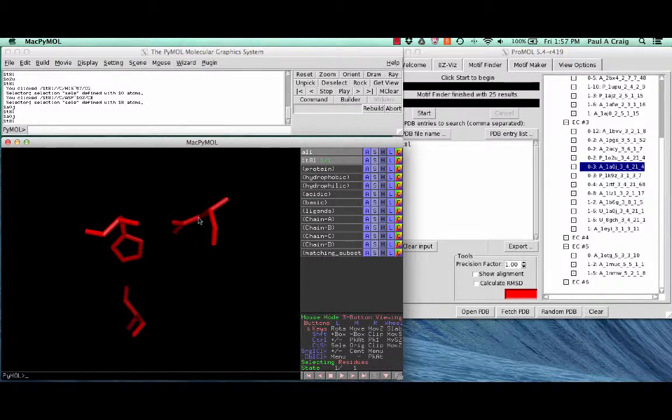When I click on them, the first one, if you look in the PyMOL GUI, you'll see it listed there. It says you clicked /1T8L/C/ASP102/CB. Let me explain that. It's a structure 1T8L. We already know that. Chain C, the residue is aspartate, ASP. The residue position is 102. And the actual atom I clicked on was the beta carbon.